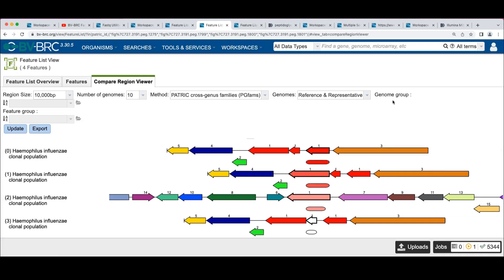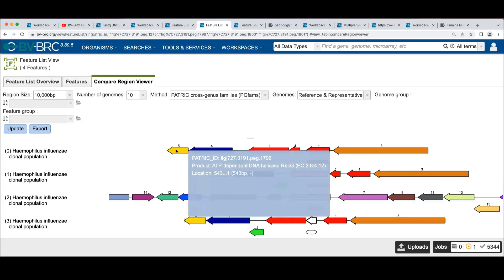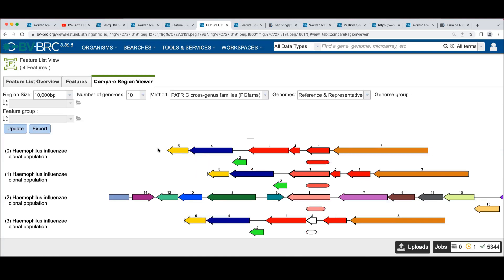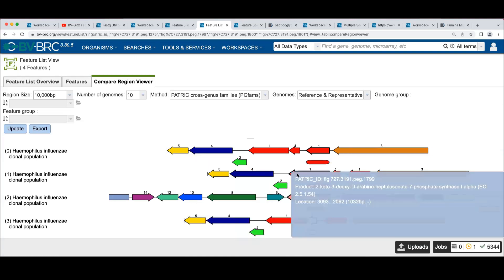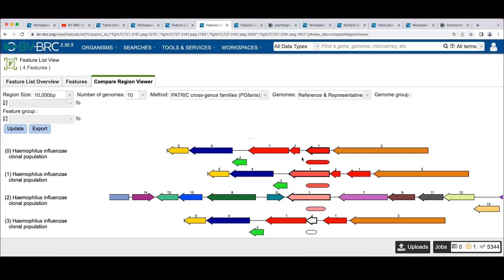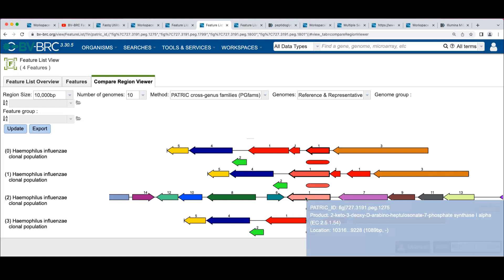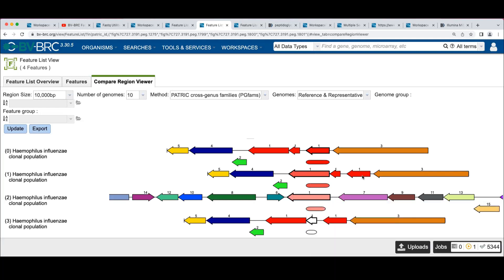because one of the problems was the contamination, the number of contigs, the size of the contigs. So this is sort of a funny display, because what we've got are three chunks of this gene, right? We have three genes with all the same name.